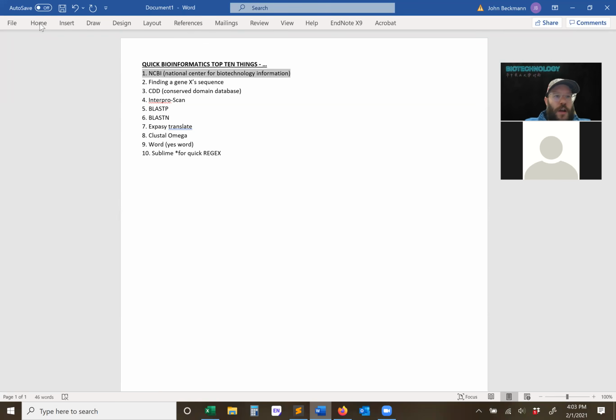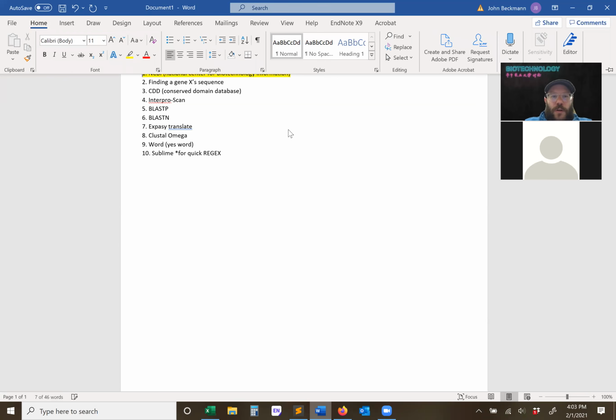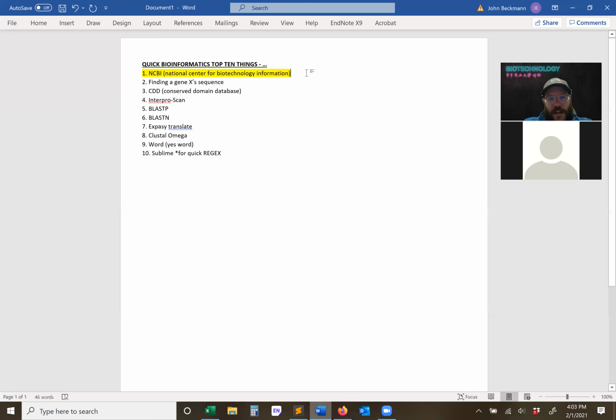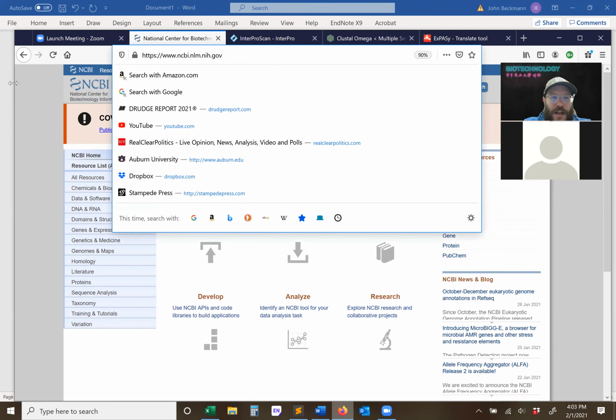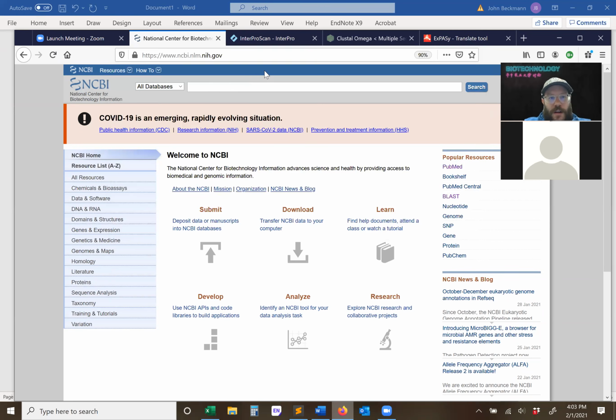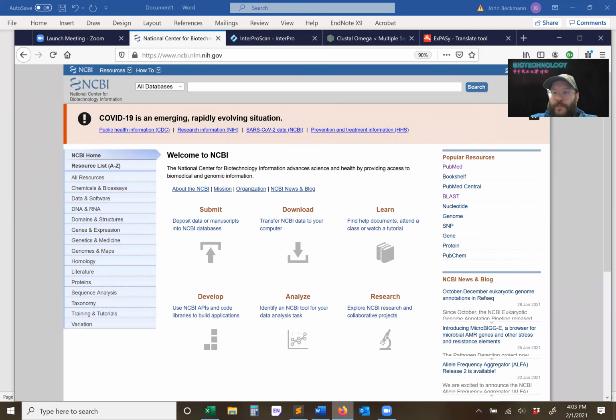Okay, so the first website you definitely want to know about, if you haven't heard about it yet, is the National Center for Biotechnology Information. If you go to this website, ncbi.nlm.nih.gov, this is an NIH funded repository of information. Every single genome that's ever been sequenced by NIH funded money is posted to this website.